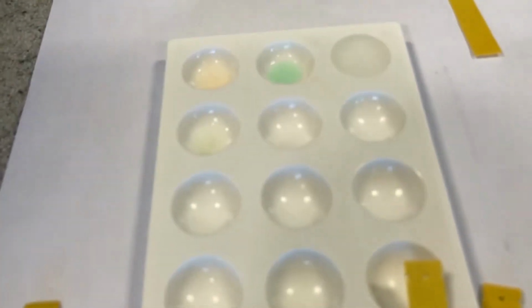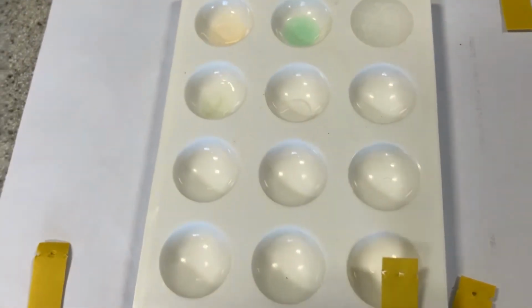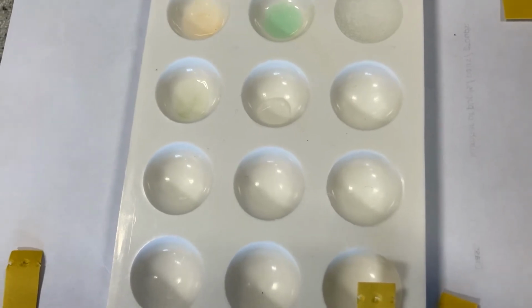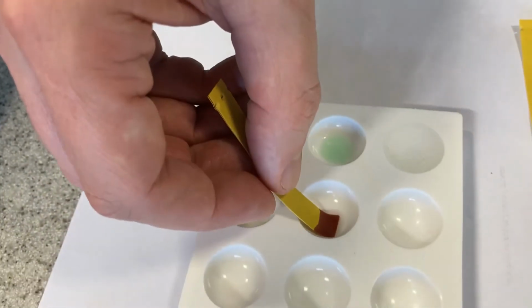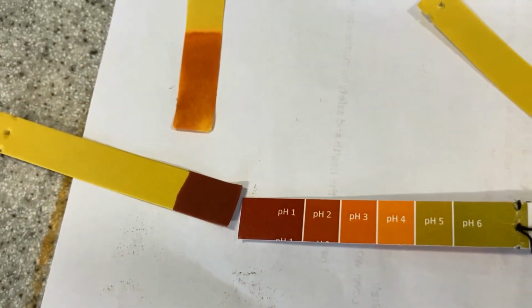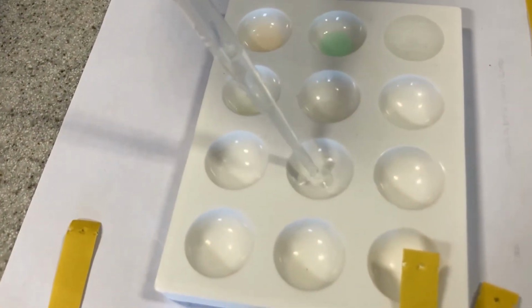Hydrochloric acid, I think that's 4. Definitely 4 drops there. And that has gone proper red. Hydrochloric acid is an acid, no doubt. This one here, sulfuric acid. Let's go.